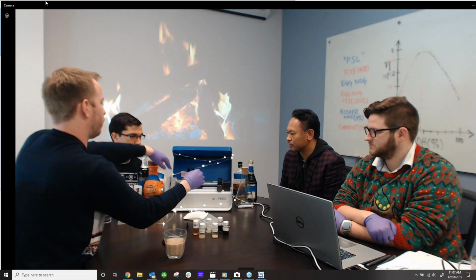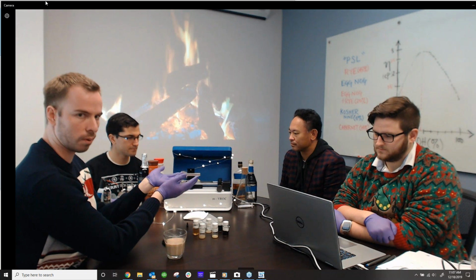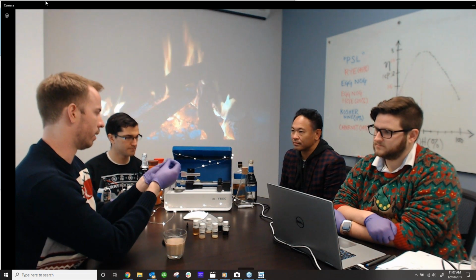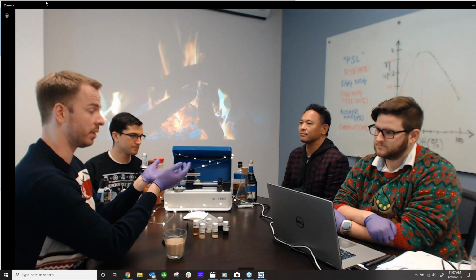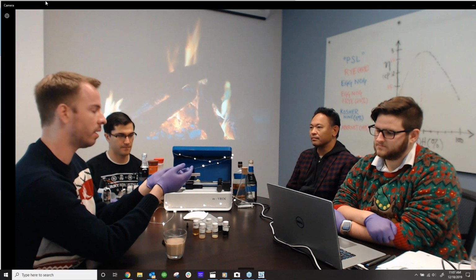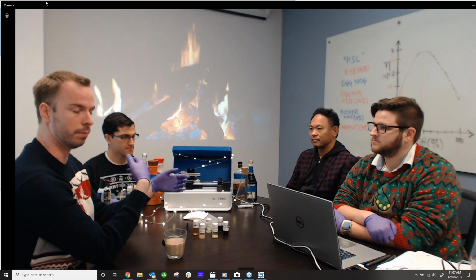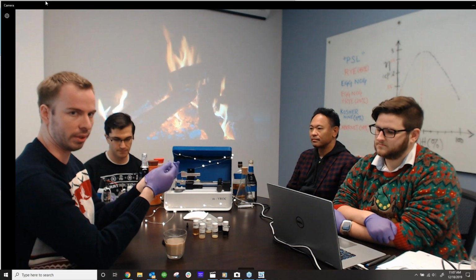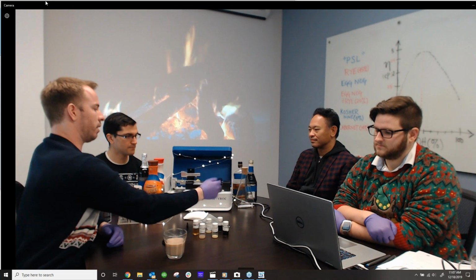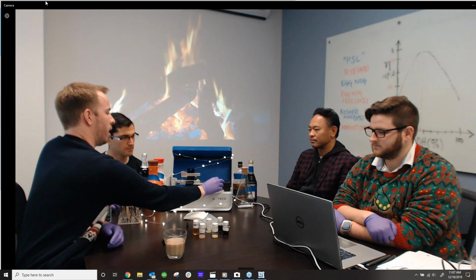There we go. Okay, I also just want to mention, since we're working with microfluidics and very sensitive sensors, the pressure sensors can be subject to damage if there's an unexpected pressure spike in the chip. So you want to make sure that you follow this order of operations whenever you load sample into the instrument. The first thing you're going to want to do is move this pusher block to the end of the plunger.